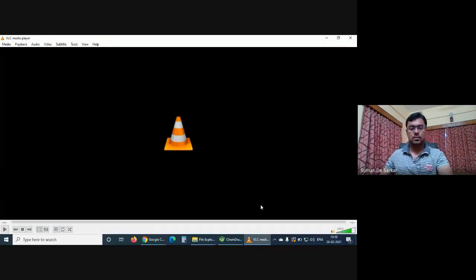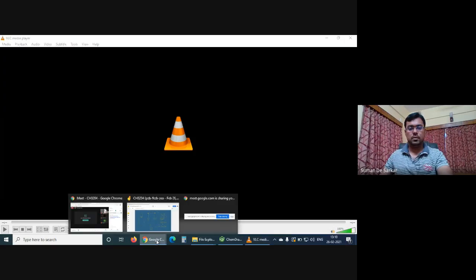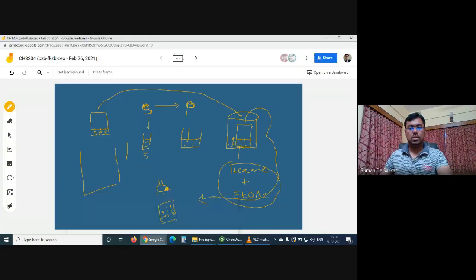All right, so this is from the video part. Just one thing before I conclude. Many times I have mentioned this RF value. What is RF value? RF value is nothing but this thing. Suppose let's take this TLC itself. Better to draw a better TLC.